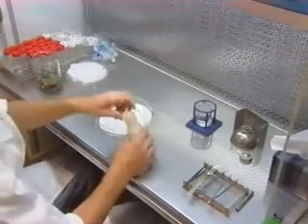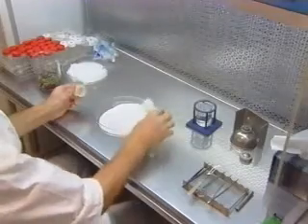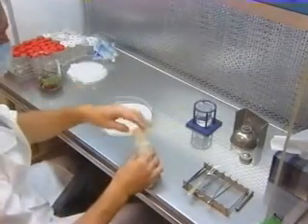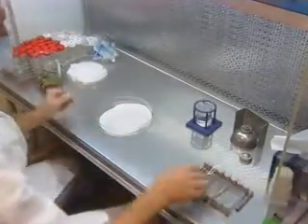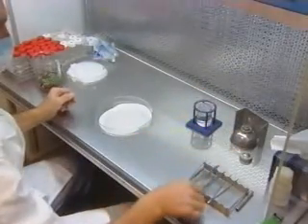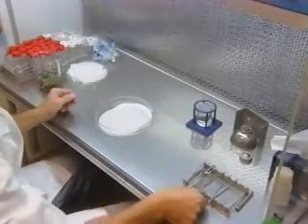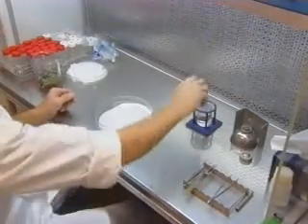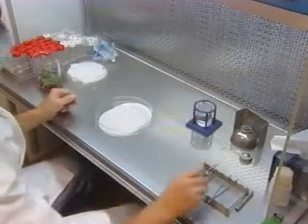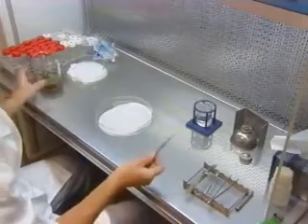The plant material, as a general rule, is cut to the desired size on a moist, sterile filter paper. It is important to note that any item used inside the laminar flow cabinet must be sterile. That is, the dissecting instruments such as the scalpels, the scissors, the forceps, and indeed the petri dishes or the papers you use to cut the plant on.